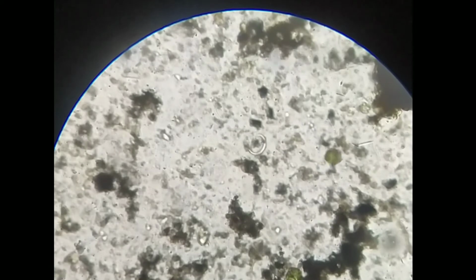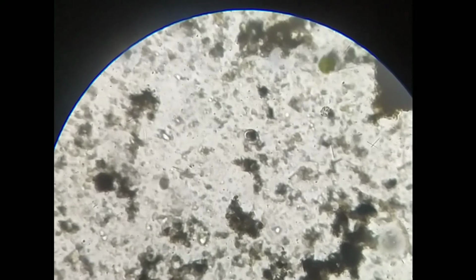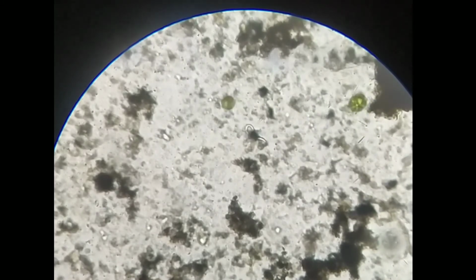As I mentioned in the previous part of this video, I've talked about green algae also, and yes, volvox also fall in that group only. They were first described by Antoine van Leeuwenhoek. As you all can see, they are very interesting, and one nematode is floating between them. They usually are found in colonies. Many volvox are floating around.